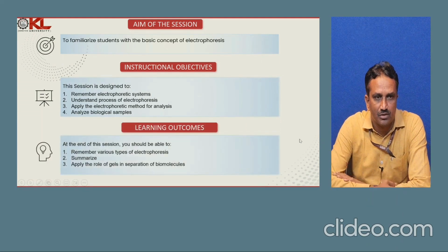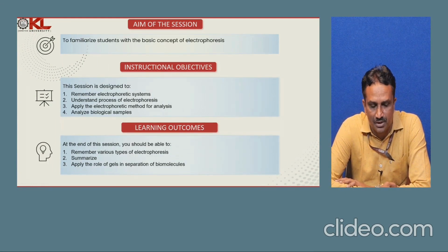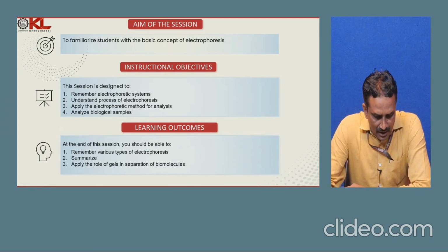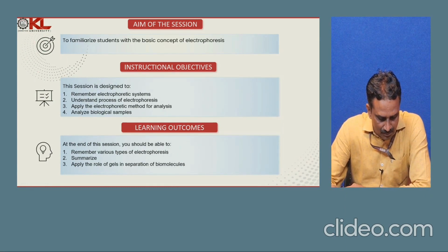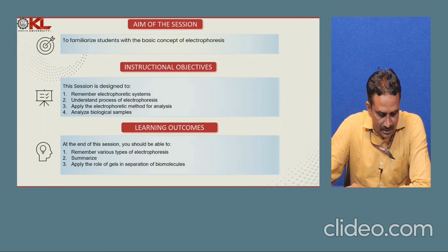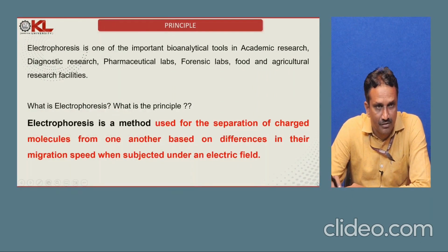The objectives of this session are especially designed to remember electrophoretic systems, understand the process of electrophoresis, apply the electrophoretic method for analysis, and analyze biological samples. The learning outcomes of this session are to remember various types of electrophoresis, summarize various types of electrophoresis, and apply the role of the gels in separation of various biomolecules.